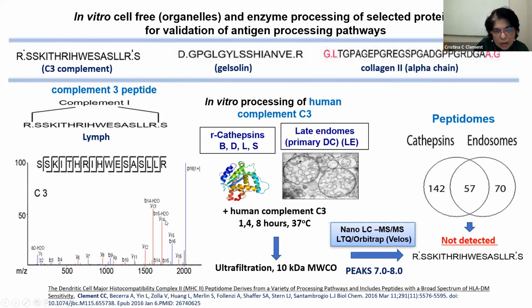So we mapped at high resolution another immunopeptidome eluted from DR1 transgenic mice, and we implemented as a pilot experiment the late endosomal processing to understand whether a selected peptide epitope, displayed here on the screen, is processed by late endosomes or by enzymes present in the sera.